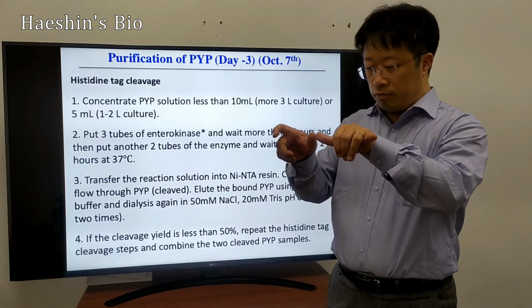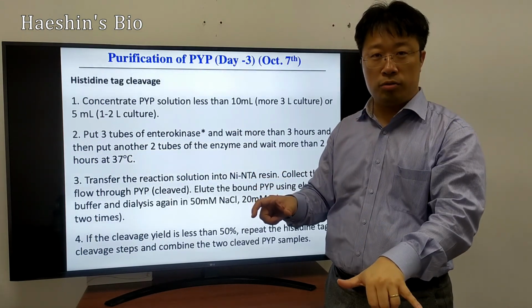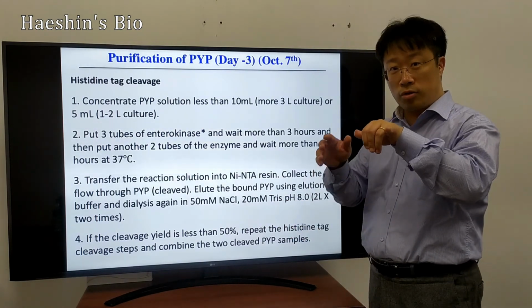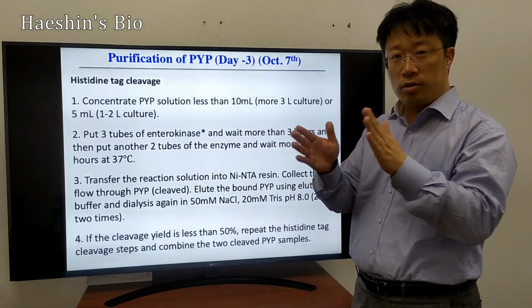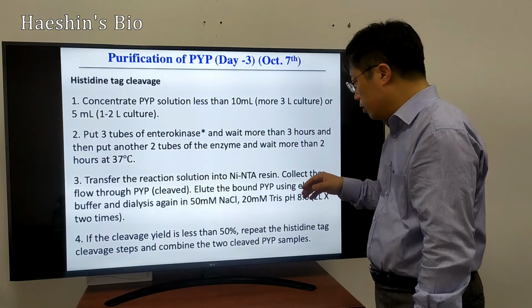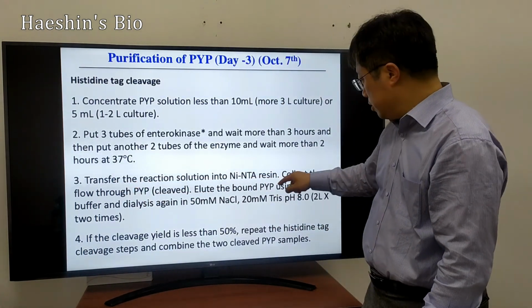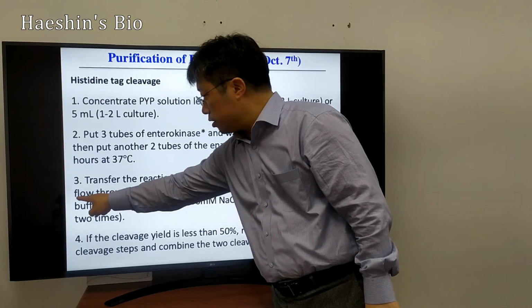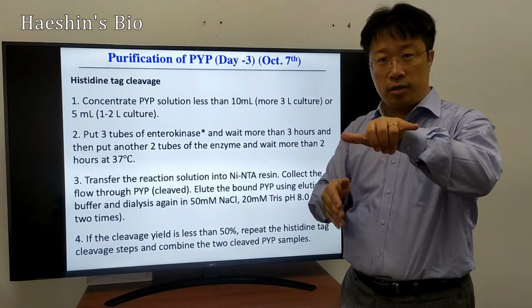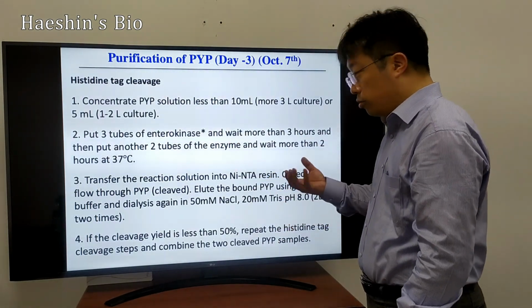However, if they are cleaved, then there's no histidine tag on this protein, so they elute through this column without binding the resin. That's why you can distinguish between the unreacted portion and the reacted portion. So transfer this reaction solution to the NTA resin and collect. That's why this is important. The PYP flows through, because it's cleaved and has no histidine tag. Okay, so then you collect that one.